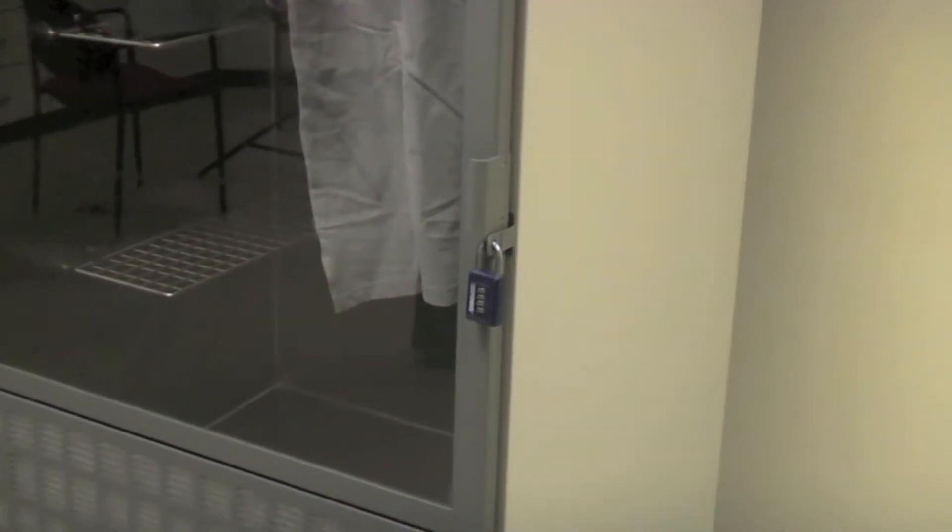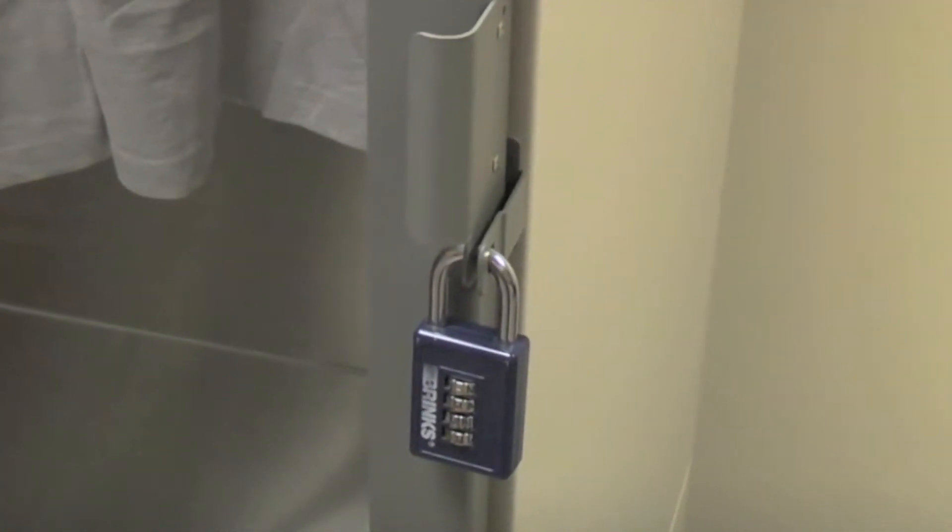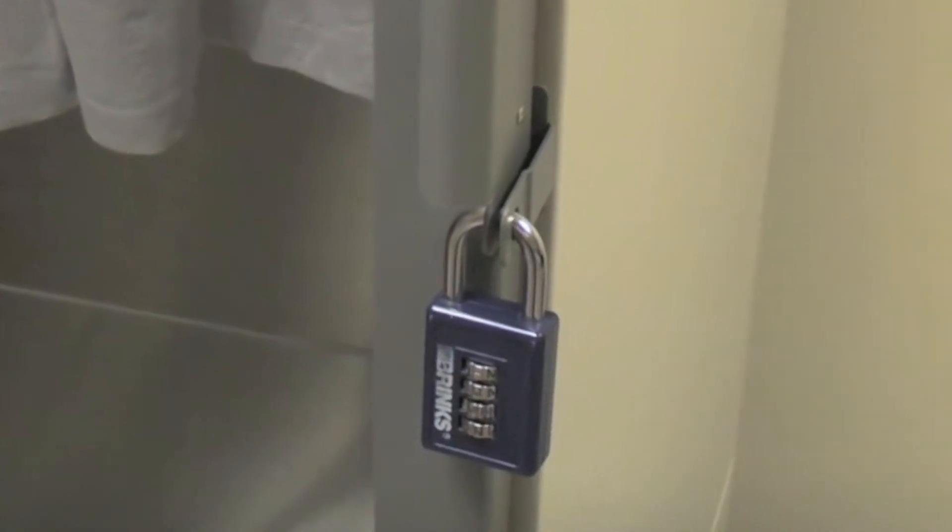The glass door includes a magnetic seal and may be secured with a user-supplied padlock or tamper evident seal.